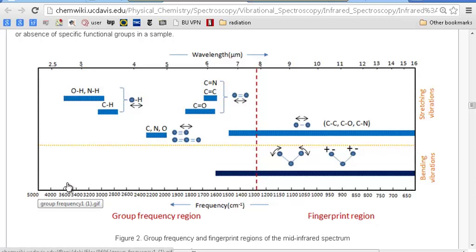Anyway, this region, the cutoff is around 1500 or this graph is about 1250. The ones to the left of that, the higher energy here, correspond to various groups in a compound. For example, if you have a carbonyl group, you'll expect to have some absorption in this region of the spectrum. And if you have CH, OH, NH, those would be down here. So those are characteristic of functional groups up here.